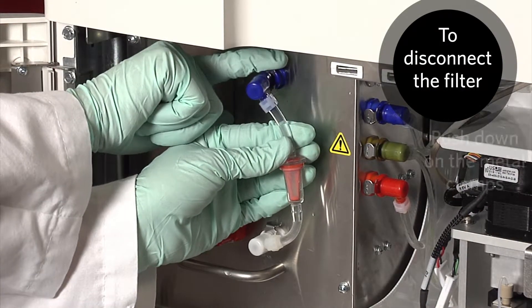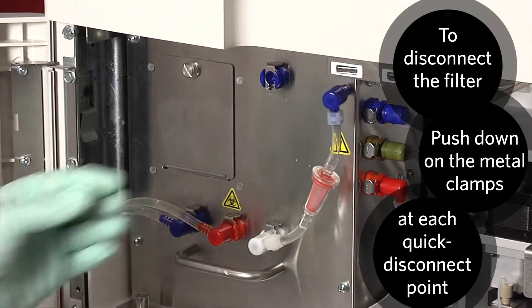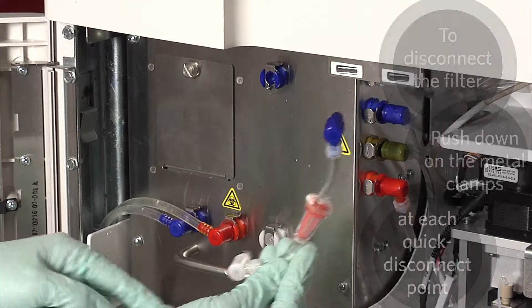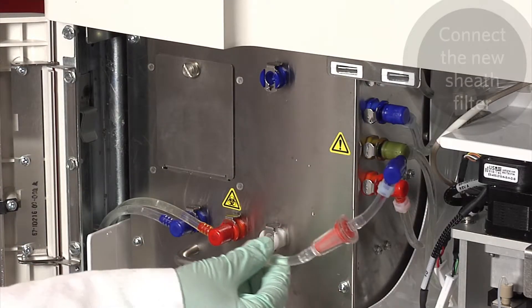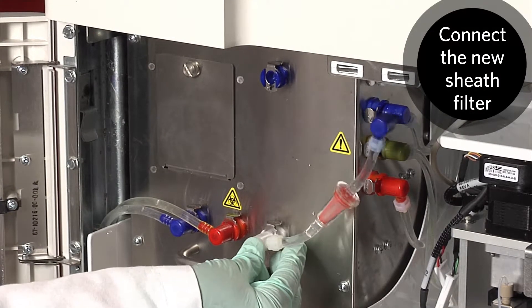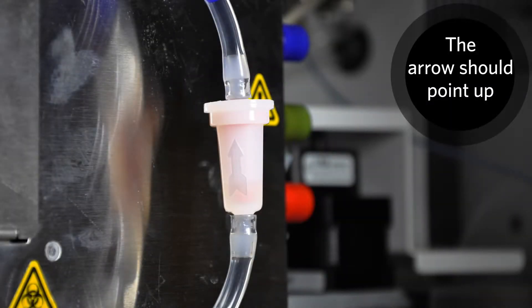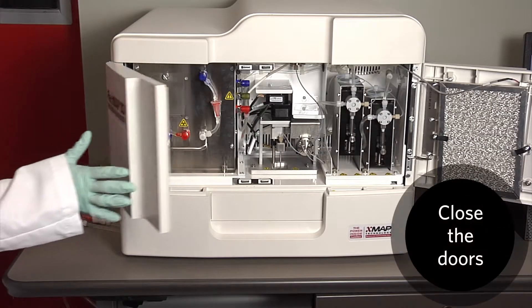Disconnect the filter by pushing down on the metal clamps at each quick disconnect point. Connect the new sheath filter, matching up the color-coded fittings. The arrow on the sheath filter should be pointing up. Close the left door.